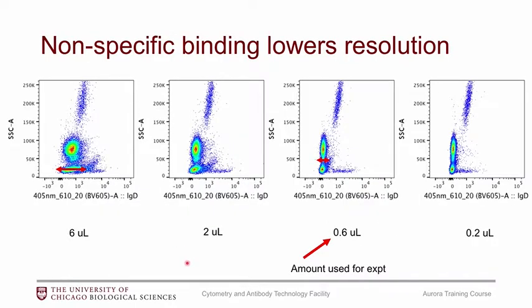Titrating also helps with resolution. For IGD, if you titrate it down you can see a very clean population. But if you use too much antibody you lose resolution and see spreading of the negative population. So definitely titrate that down.